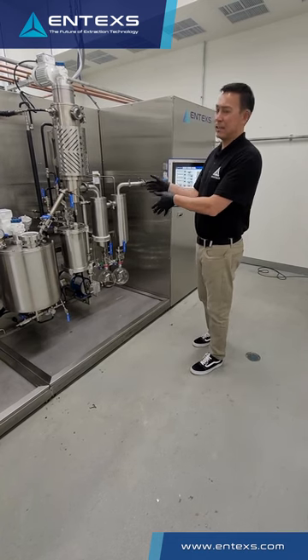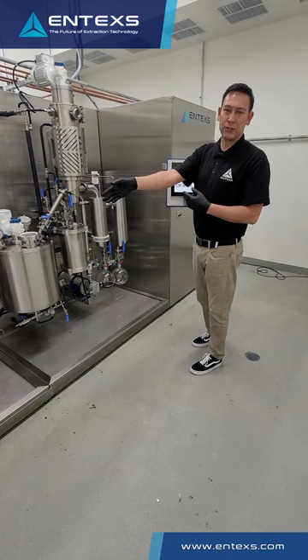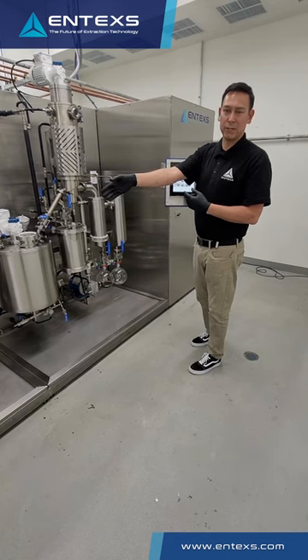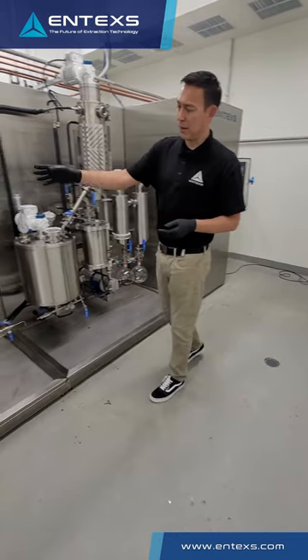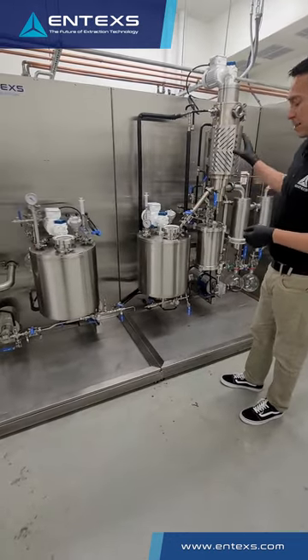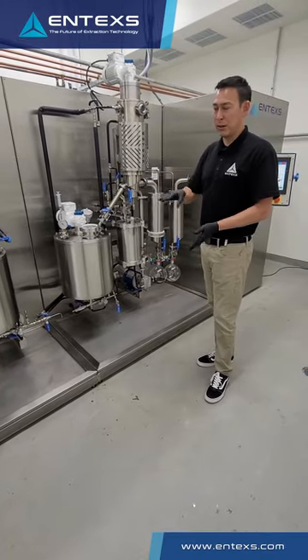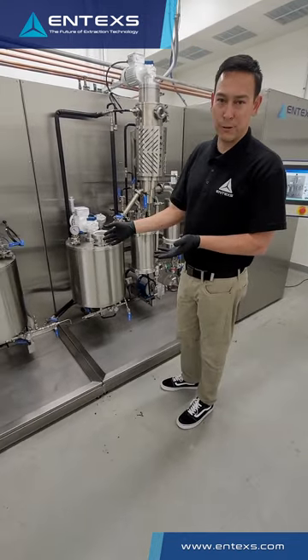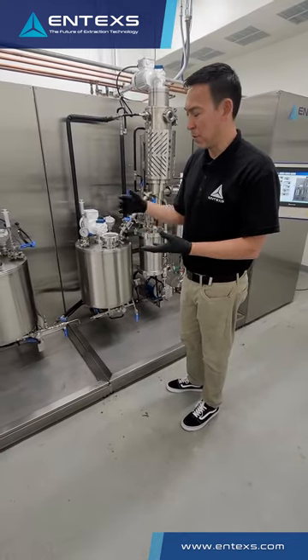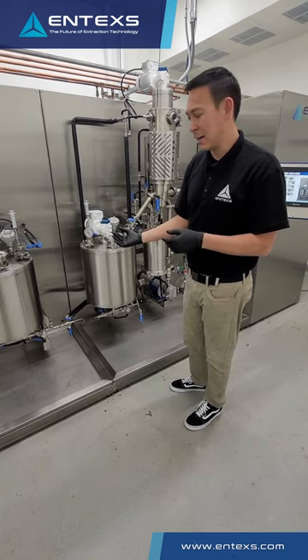This is our Entex distillation module. This supports refining of your crude oil generated in the evaporation platform. What this allows you to do is send product directly over from the evaporation system into distillate so you can refine your oil and off-take without the oil ever seeing oxygen or the light of day. This really increases efficiency — you don't have any product transfers that result in inefficiencies and product loss.